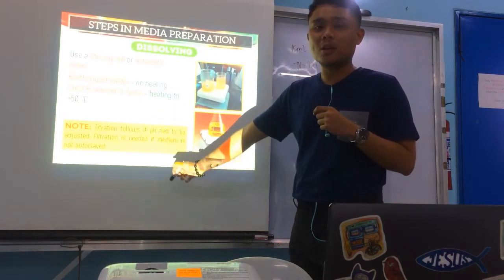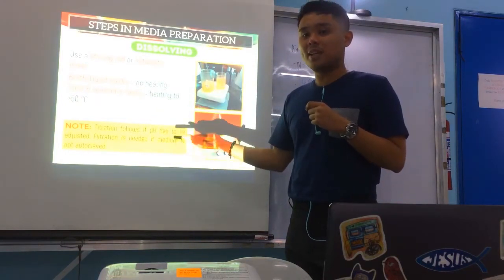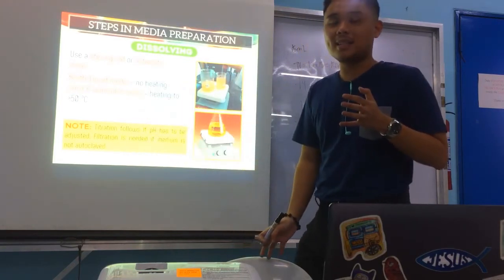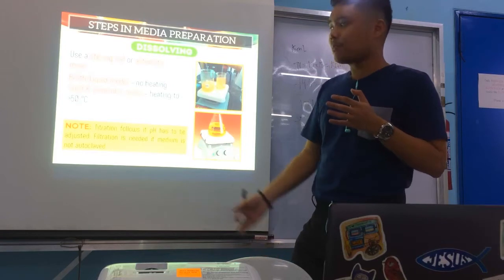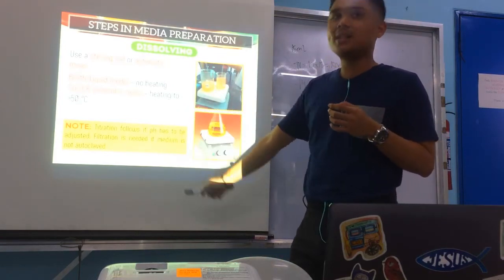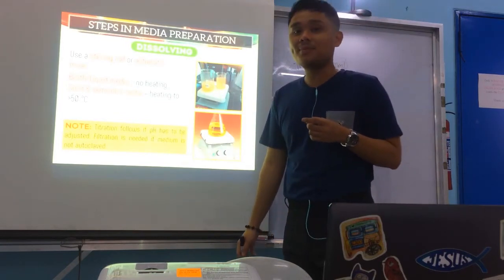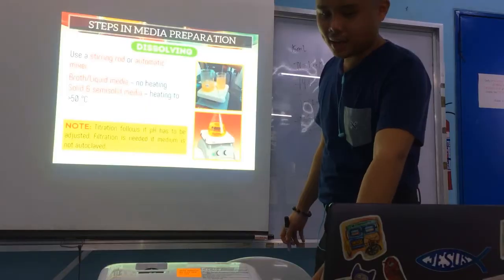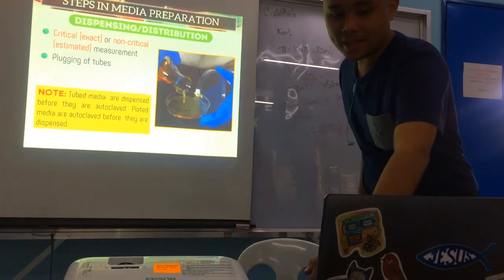If the pH is to be adjusted, we use titration. And if the culture medium is heat sensitive and cannot be autoclaved, we use filtration. A good example of a heat sensitive culture medium is urea broth. Recall our discussion on sterilization and disinfection: filtration. For liquid, we use cellulose acetate, and for air, we use a HEPA filter, high efficiency particulate air.